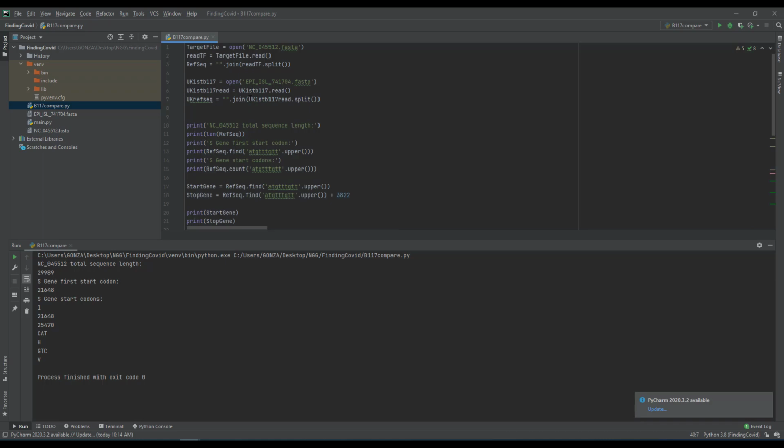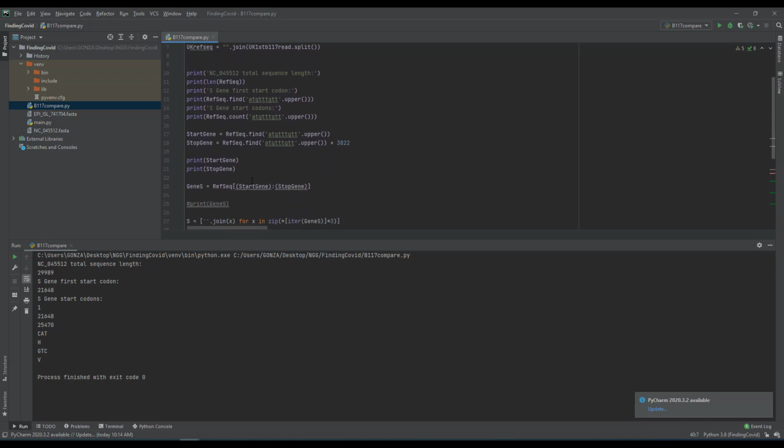Okay, so then what we're going to do is make another file, another code for the B.1.1.7 strain. And let's see here. I'll have to do a video on nomenclature to understand how they name them. It's really just every time a different set of variants show up, they extend it if it had previous variants.